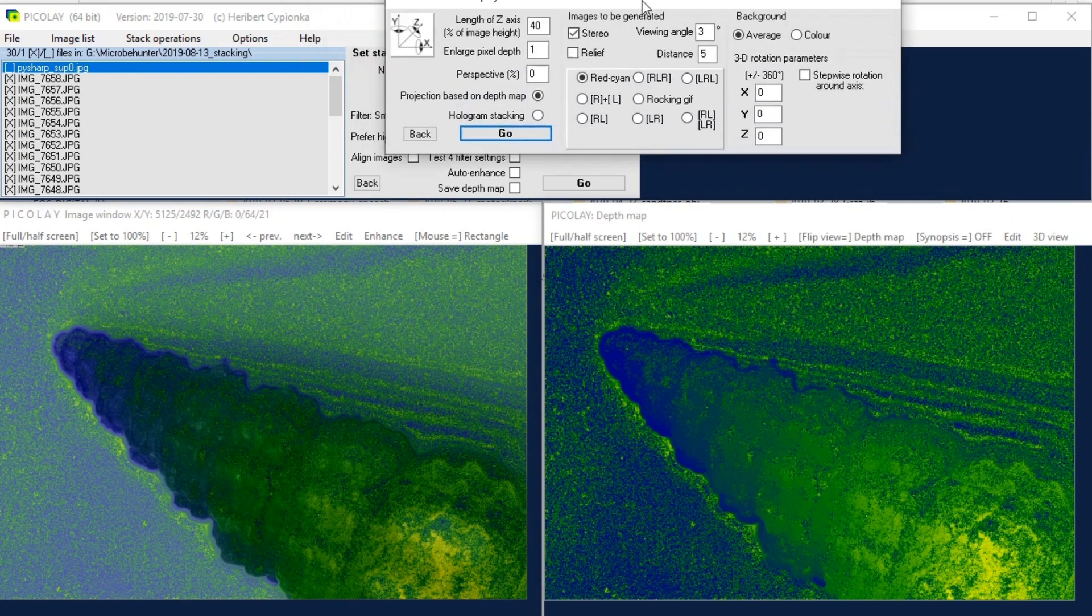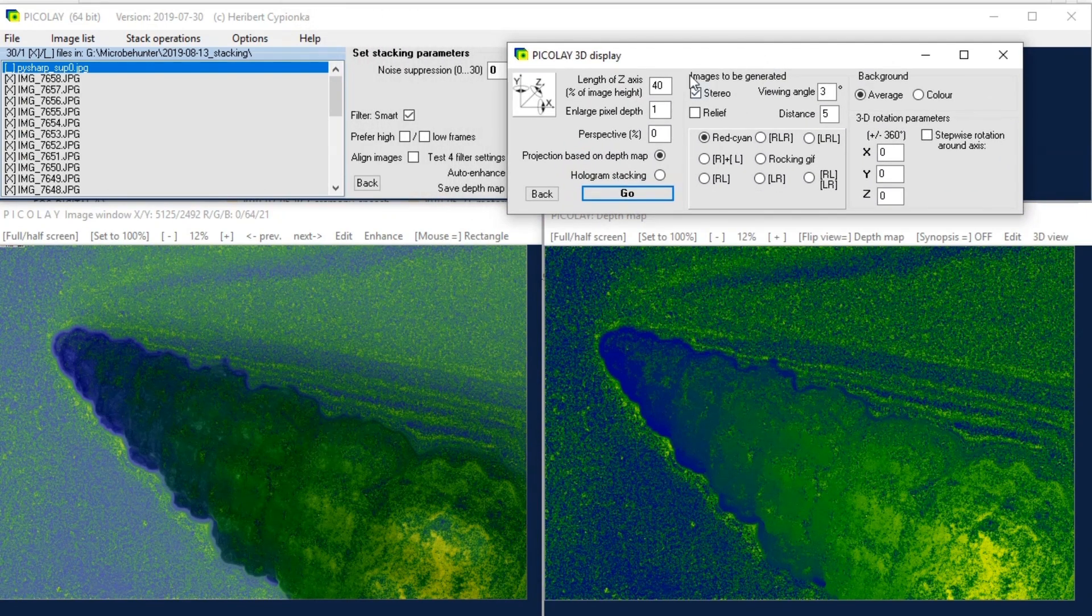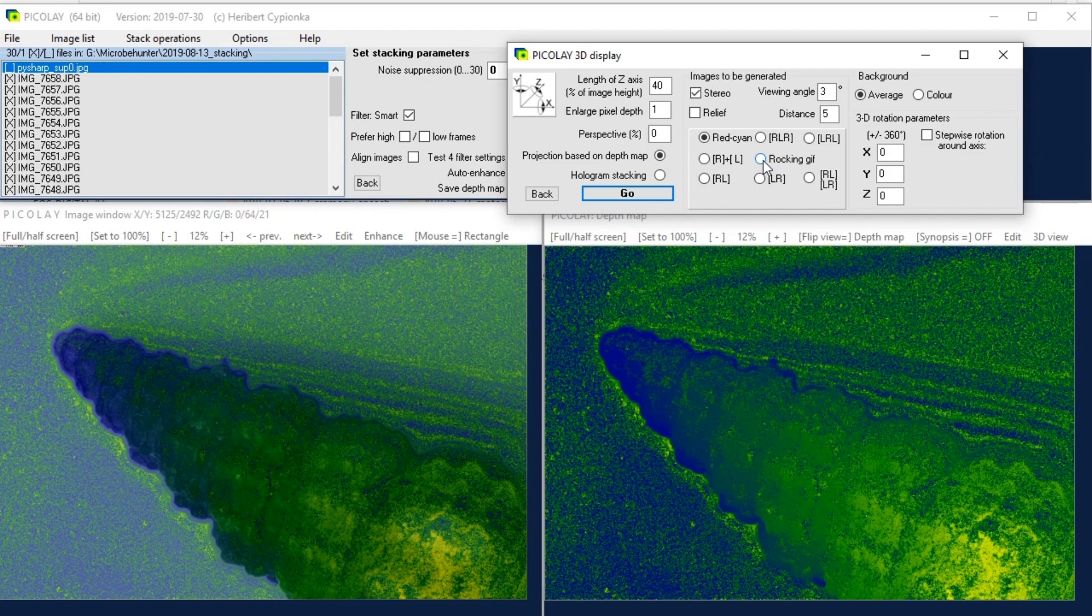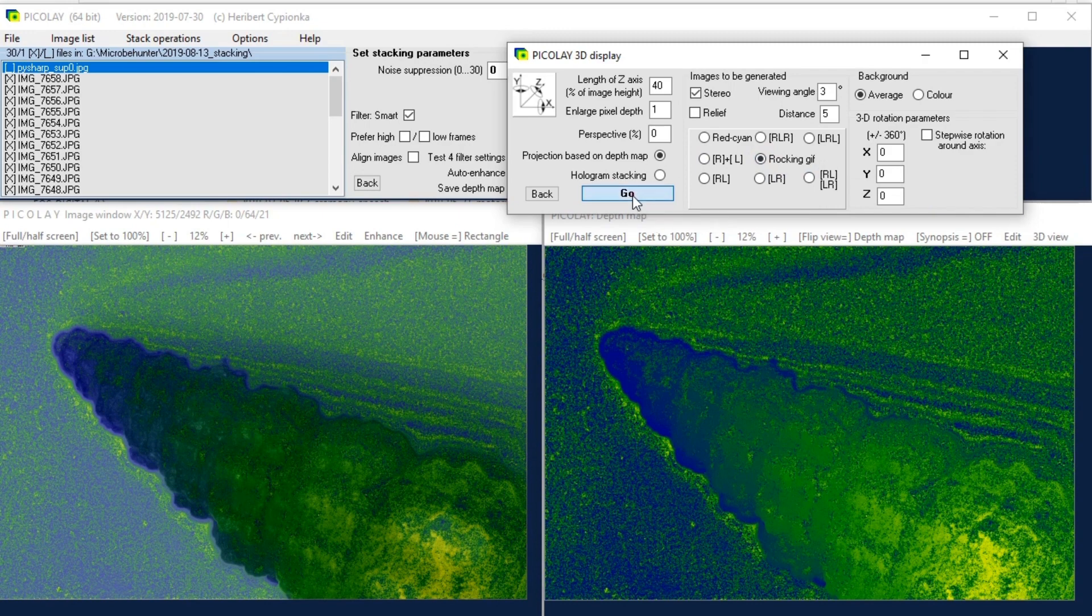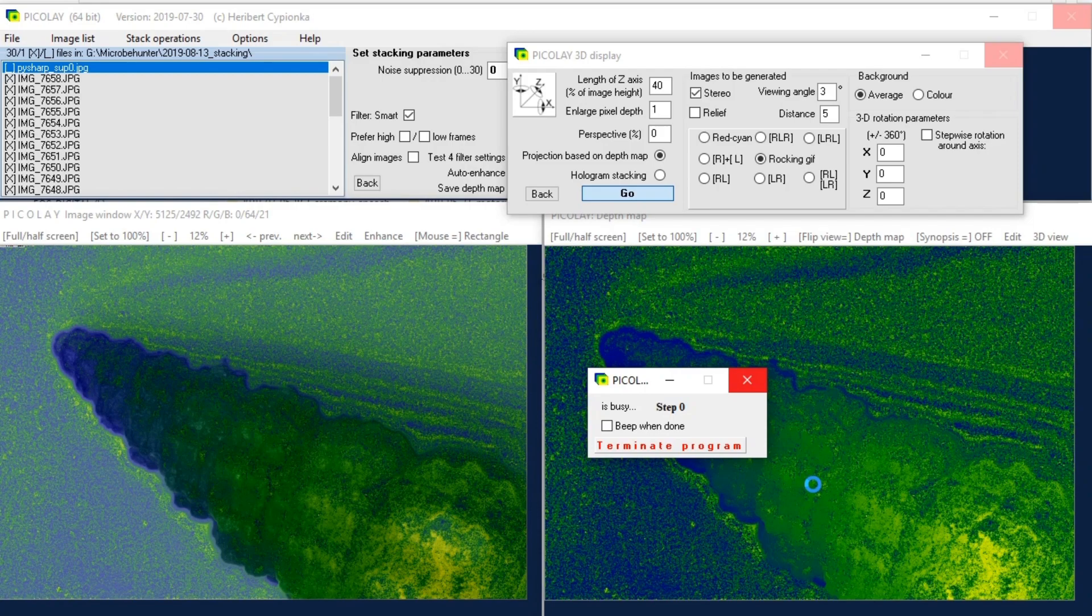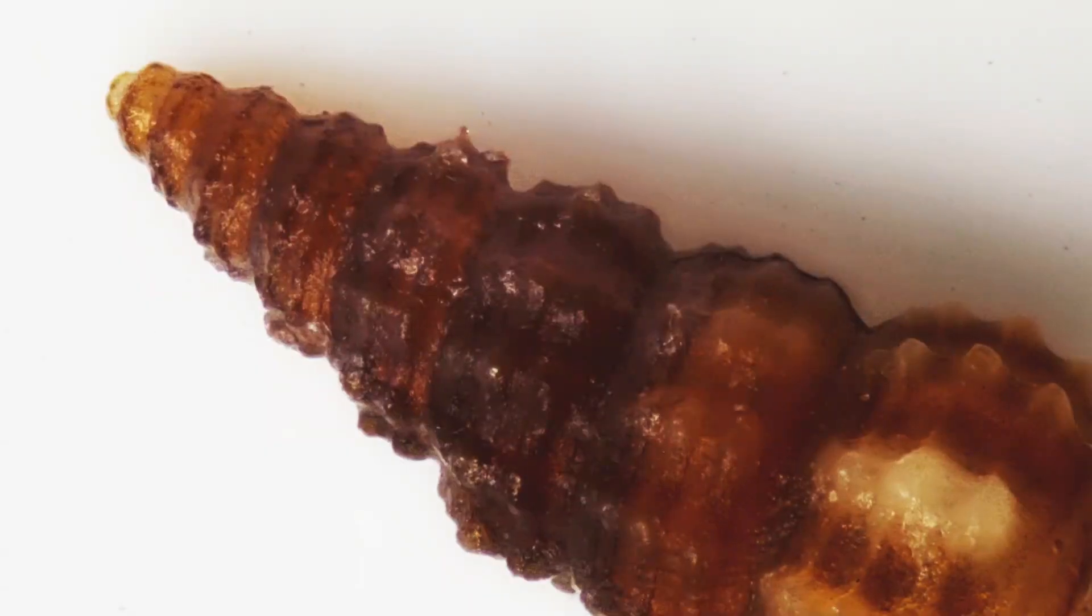I'm just going to show you something else now if you click 3D view you can also make certain three-dimensional adjustments for stereoscopy so rocking GIF that's what I want to just show you and you click go you have to wait again several minutes and it will make a GIF an image that moves back and forth like this giving also a three-dimensional impression.